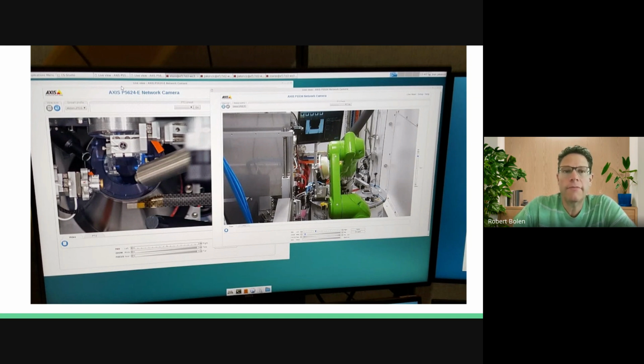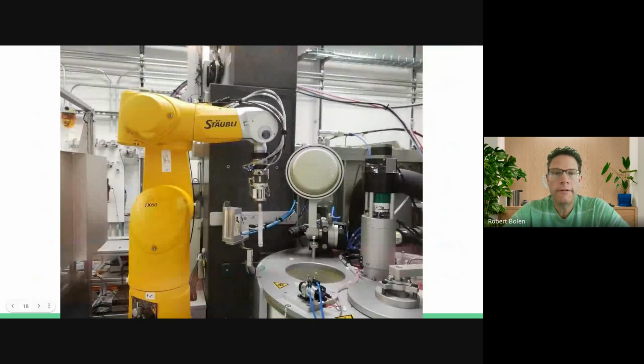So the X-rays will actually come from the top of the screen, pass through our crystal, and then there's a detector that's off screen at the bottom, and that's what will pick up the diffraction pattern once the X-rays hit it. This is Big Bird, and at the end of Big Bird, you can see it has a little googly eye here. There's this long, kind of frosty looking structure. That's called the gripper. That will actually pick up the individual pins from the pucks.